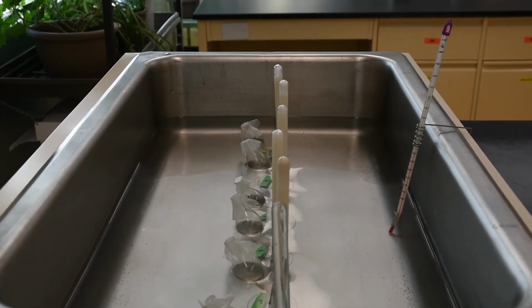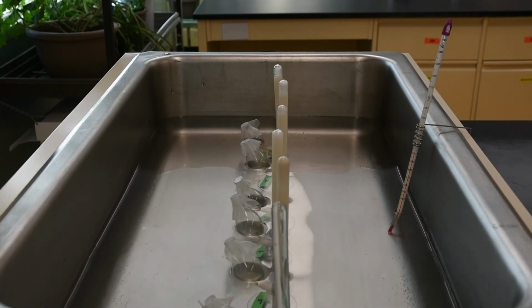Right, so our tubes are now in the water bath, 37 degrees C, and that's going to kick-start the process of glycolysis. So the experimental tubes that are able to create carbon dioxide, that's going to be represented by a bubble forming in the top of the tail of the fermentation tube. So I'm simply going to be measuring every 5 minutes the amount of carbon dioxide produced, and that will give us an idea about how well glycolysis and the alcoholic fermentation of yeast has progressed.